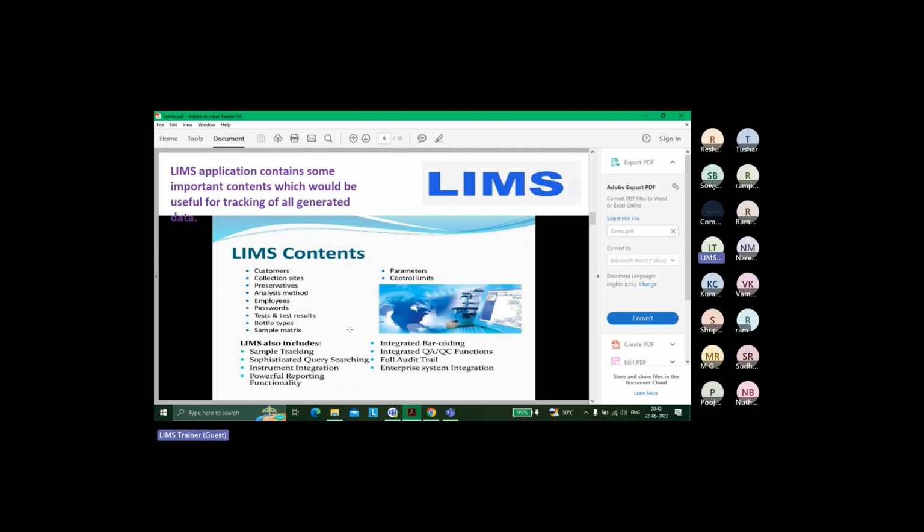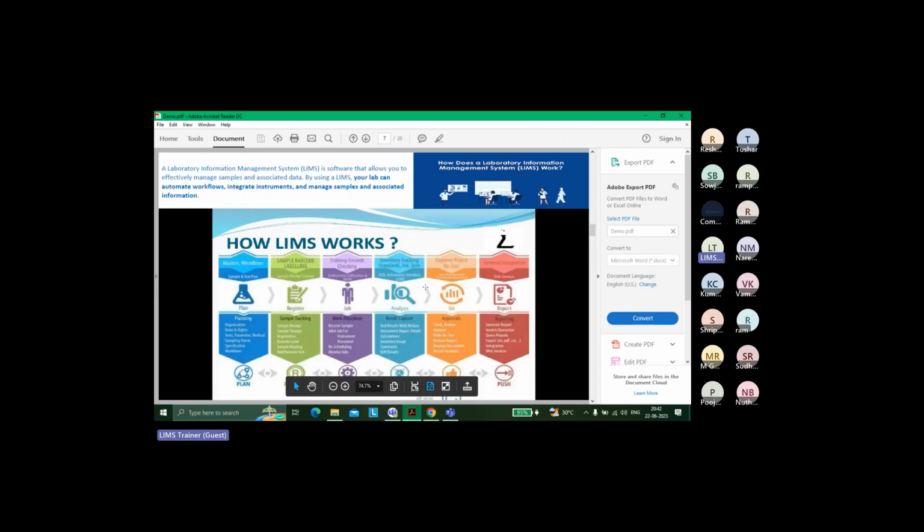Query searching is also possible in LIMS. For example, I ask you to give me an output of who logged into this sample, or how many samples this user created between this date and that date. A very simple example. LIMS can do a lot of things, but these are all the basic things. Again, we can work with inventory. There is an inventory manager, an environmental monitoring (EM) module, and a stability module.